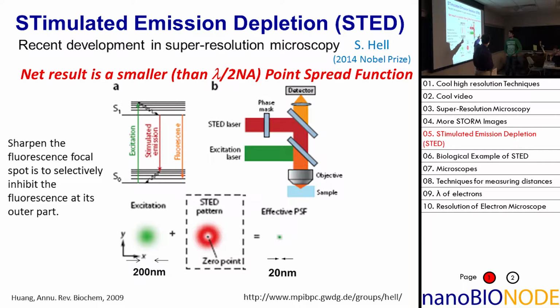So now let's look at the STED laser. The stimulated. Okay? So first, you need to put some sort of phase mask there, so you get the hole in the middle. And then similar deal, although actually it's a little bit different.